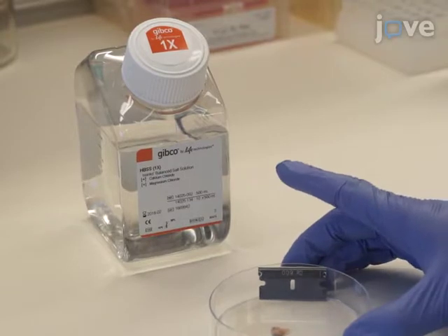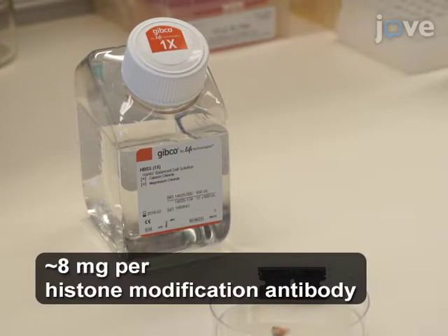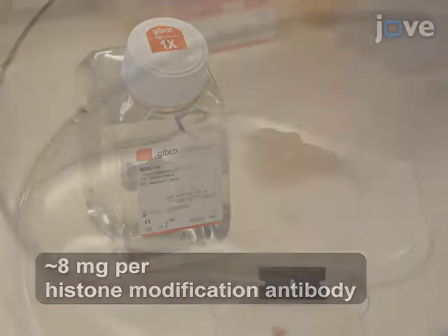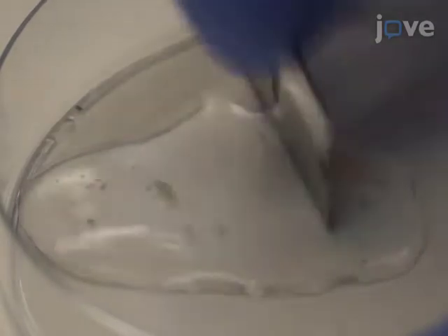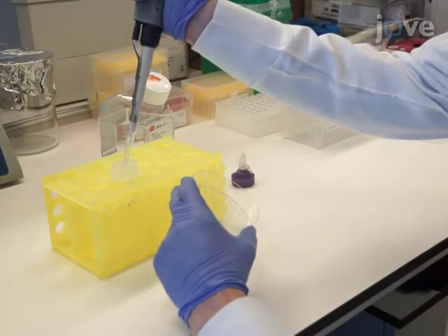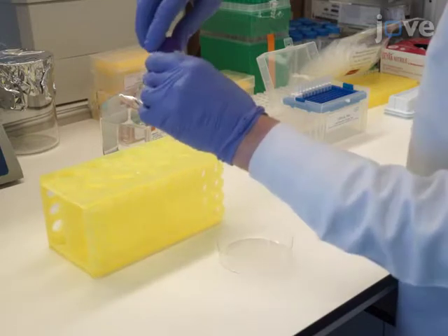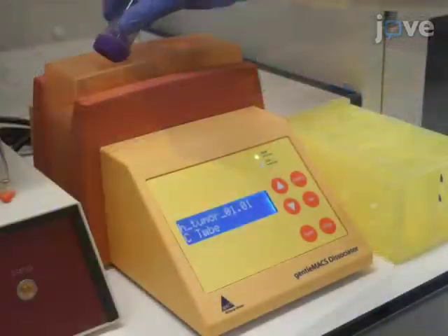First, dissociate 50 mg of melanoma tissue manually in 2 ml of Hanks balanced salt solution, or HBSS, using a sterile razor blade. Mince the tissue into 3 to 4 mm pieces for approximately 5 minutes in a sterile tissue culture dish. Transfer the tissue solution into a dissociator tube and add another 8 ml of HBSS. Further dissociate the tissue using a dissociator until homogenized.